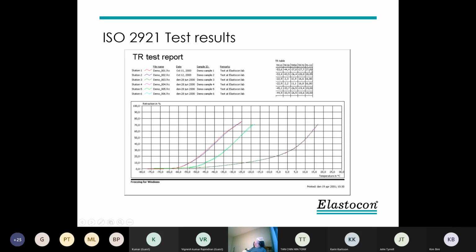And we also included one thing here, the difference between 70 and 10%. It indicates, say, how steep the curve is here. Because you can see that the fluororubber starts recovering at quite low temperature, but it goes very slowly. And some other materials go much faster. That is also interesting. And that you will get when you have it on a graph like this.